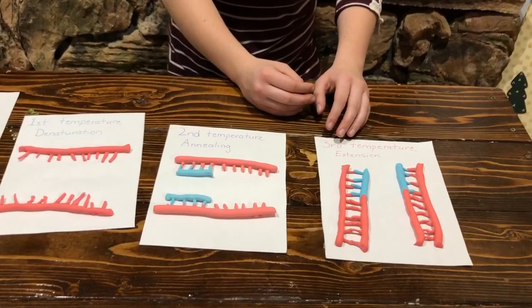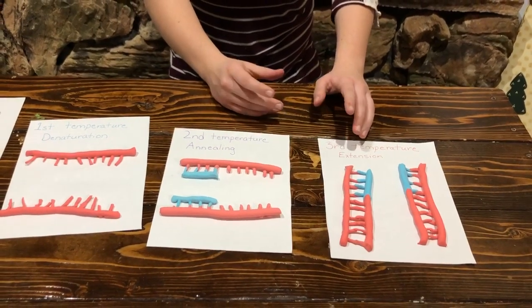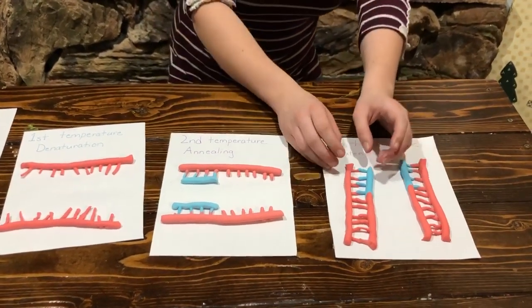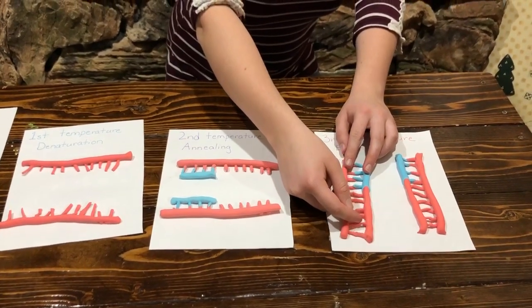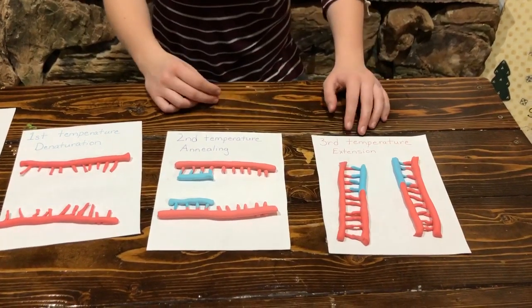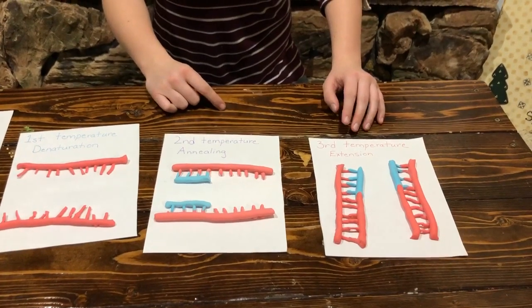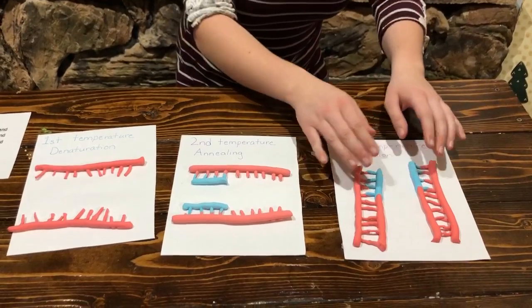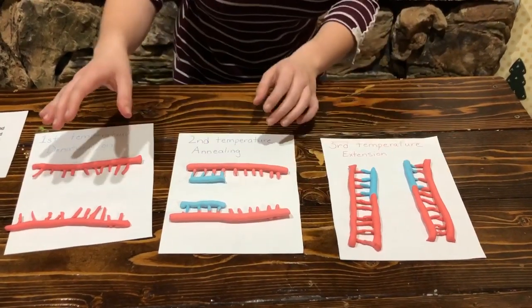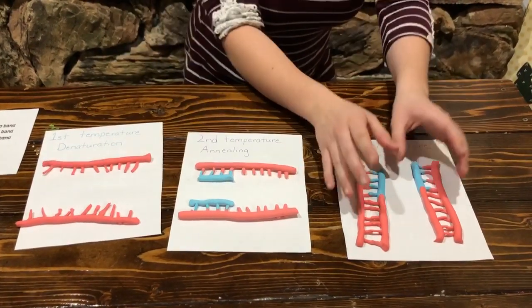to separate DNA pieces. During this third temperature, the DNA polymerase takes the nucleotides and extends the primers to create a new DNA strand. Each time the thermocycler goes through the cycle containing these 3 temperatures, it doubles the amount of DNA. It went from 1 piece of DNA to 2.